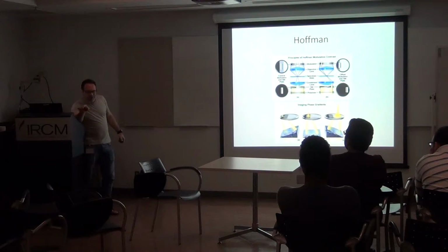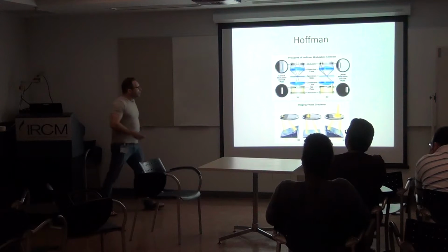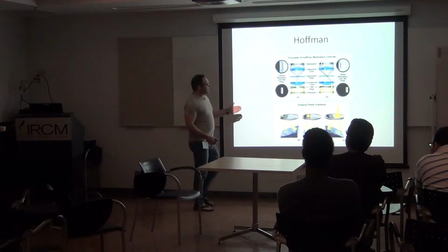Did you have the chance to look through a window and see the earth and see the sun? And the sun is not always from the top, and sometimes it goes really close to the earth. And then the lighting is really from the side. And then if you look carefully on the ground, you will see shadows everywhere in one direction. And the other position will be really bright. And it looks really like from a plane. When you look into a microscope, you look at your specimen, it's really like if you were really from the top and you see the ground. And it's the same thing.